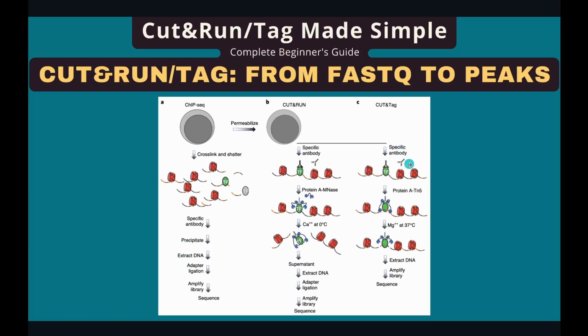CUT&Tag follows the same process, except the enzyme used is called PA-Tn5. This enzyme is activated by magnesium ions, and it can also insert adapters at the same time as it cuts. And then the resulting regions are subjected to sequencing, just like in CUT&RUN.